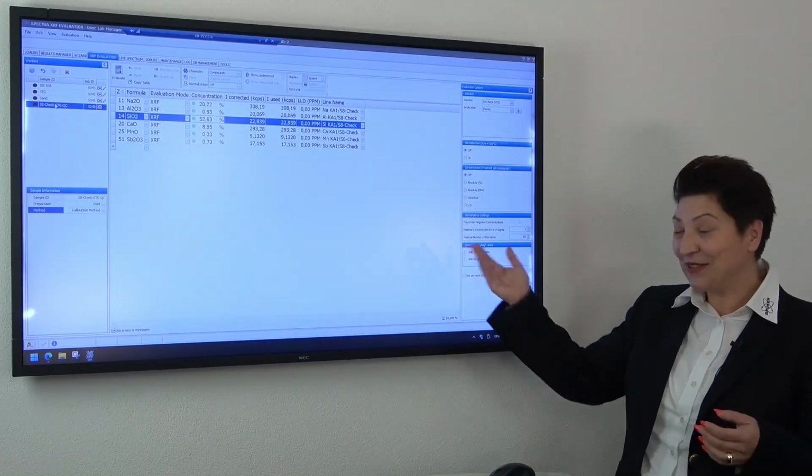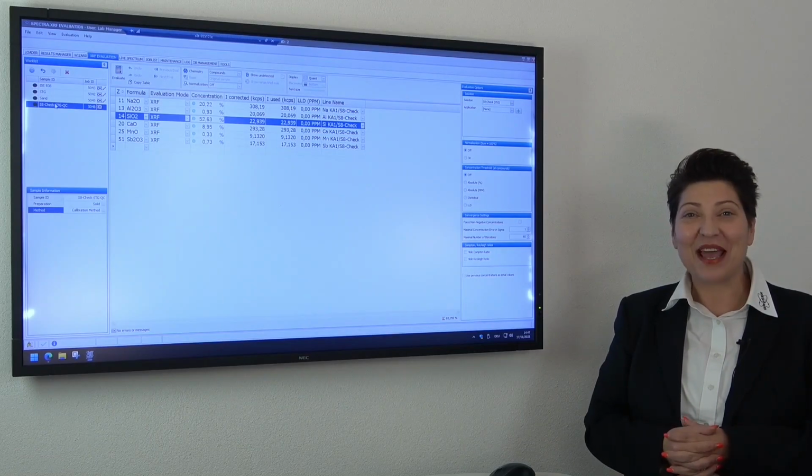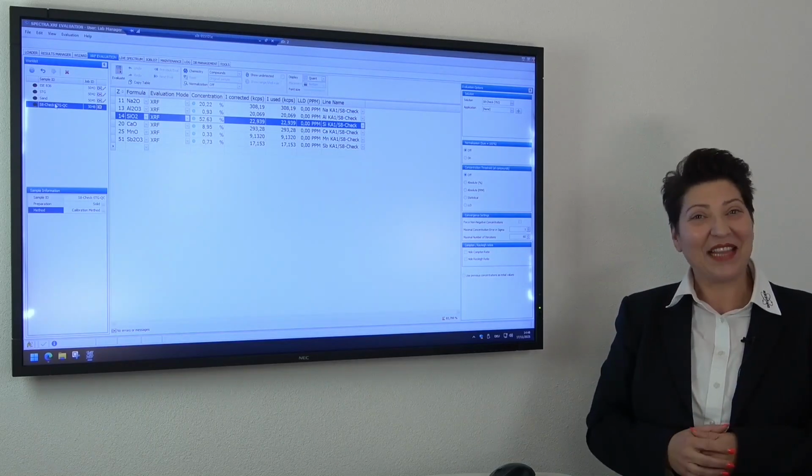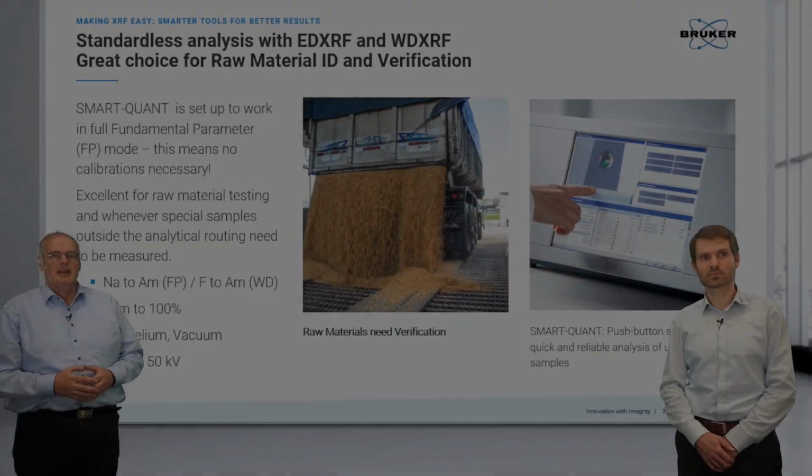That's from my part now about the standardless software. So I hope you get a good impression about our standardless package. And so let's go back to the studio. Thanks a lot.